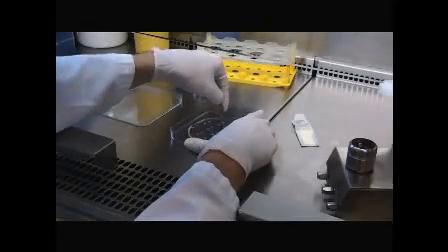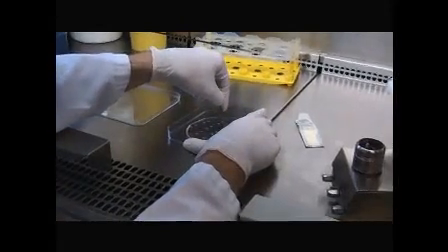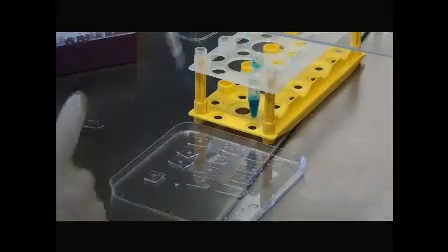Using a silicon master, PDMS stamps with an array of squares with feature size and depth of 3 micrometer are produced from a gel and cut out. The stamps are rinsed with 100% ethanol and double distilled water and dried with nitrogen before they are incubated with 0.67 milligrams per milliliter of Cy5 labeled BSA solution for 30 minutes at room temperature.